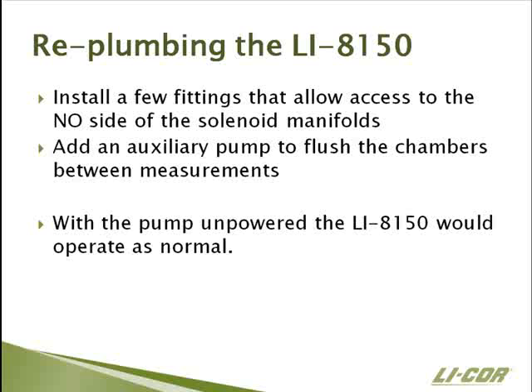The next thing you're going to do is add an auxiliary pump inside the 8150, and what this pump does is it serves to flush the chambers with ambient or conditioned air between measurements. This keeps the chambers at near ambient conditions when you're not making measurements. This is important because otherwise, if we just leave the chamber sealed, CO2 is going to continue to accumulate in there beyond the measurement period, and eventually the airspace inside the chamber is going to come into equilibrium with the airspace inside the sample. And since what we're essentially measuring are diffusive fluxes, once there's no gradient there, there's no more flux.